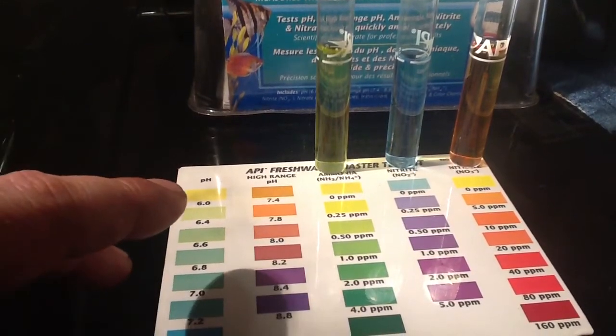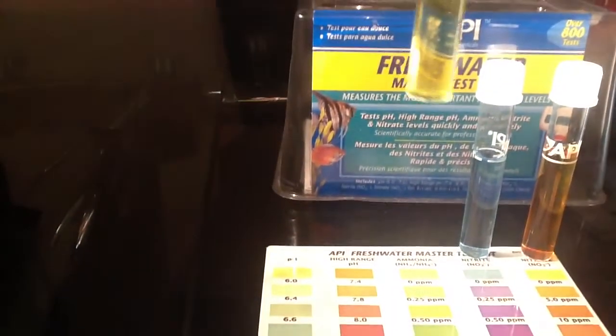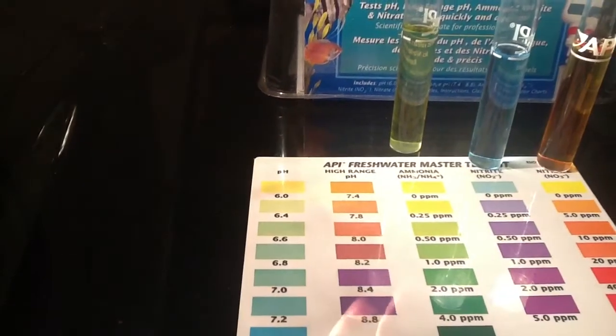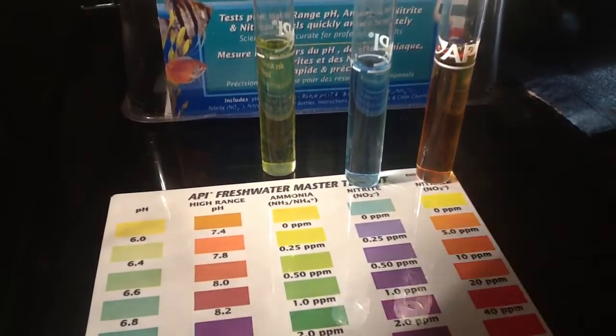Anyway, here goes. So, ammonia - hold this up to the torch - that's it, zero guys. Nitrite - zero.